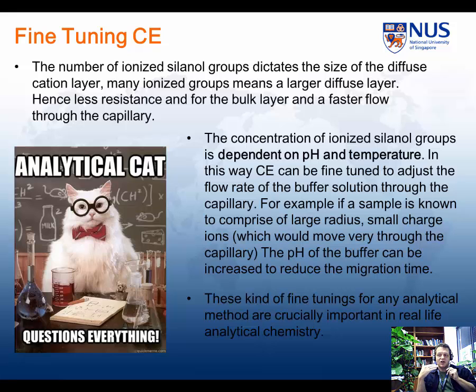Remember that the surface of your capillary, well, let's go back. In inorganic chemistry, by now, you've no doubt been interested in structural defects, so Schottky defects or screw defects. Very interesting and useful they are too.